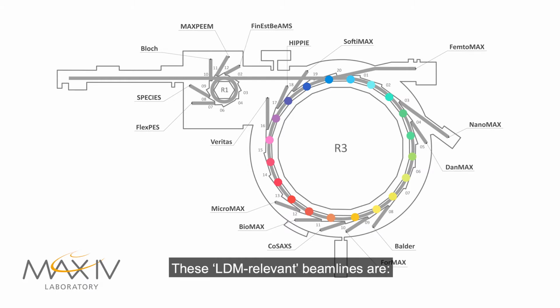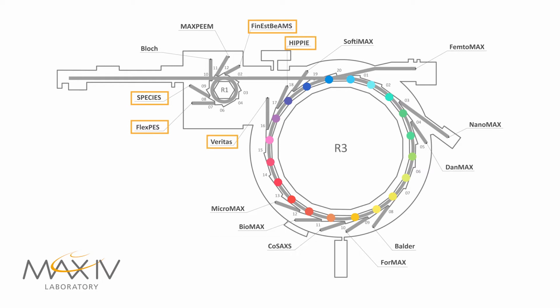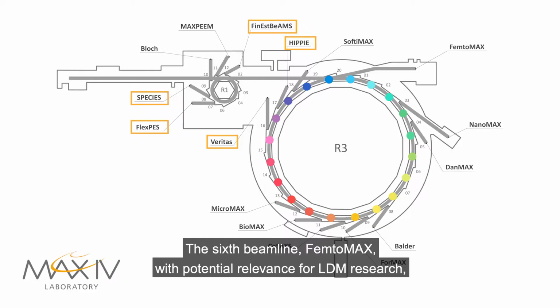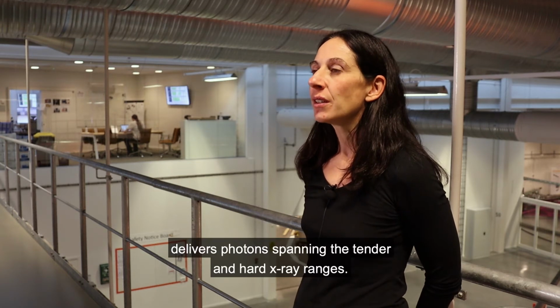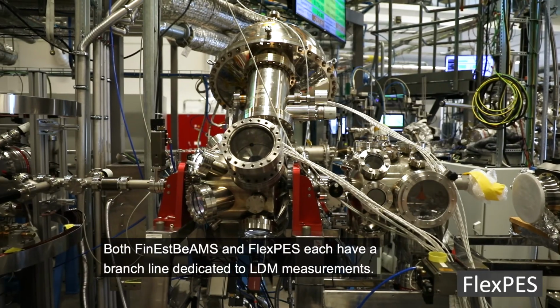These LDM relevant beamlines are FinEstBeAMS, FlexPES and SPECIES on the 1.5 GeV ring, and Veritas and HIPPIE on the 3 GeV ring. The 5 ring beamlines deliver photons with energies ranging from 4 eV up to 2200 eV. The 6th beamline, FemtoMAX, with potential relevance for LDM research, delivers photons spanning the tender and hard X-ray ranges. Both FinEstBeAMS and FlexPES each have a branch line dedicated to LDM measurements.